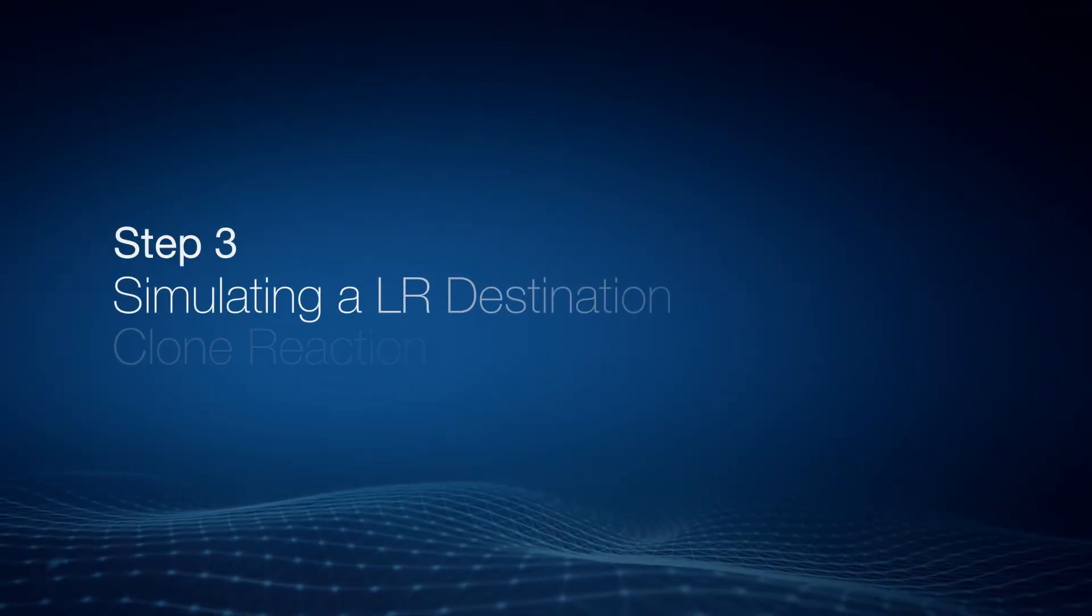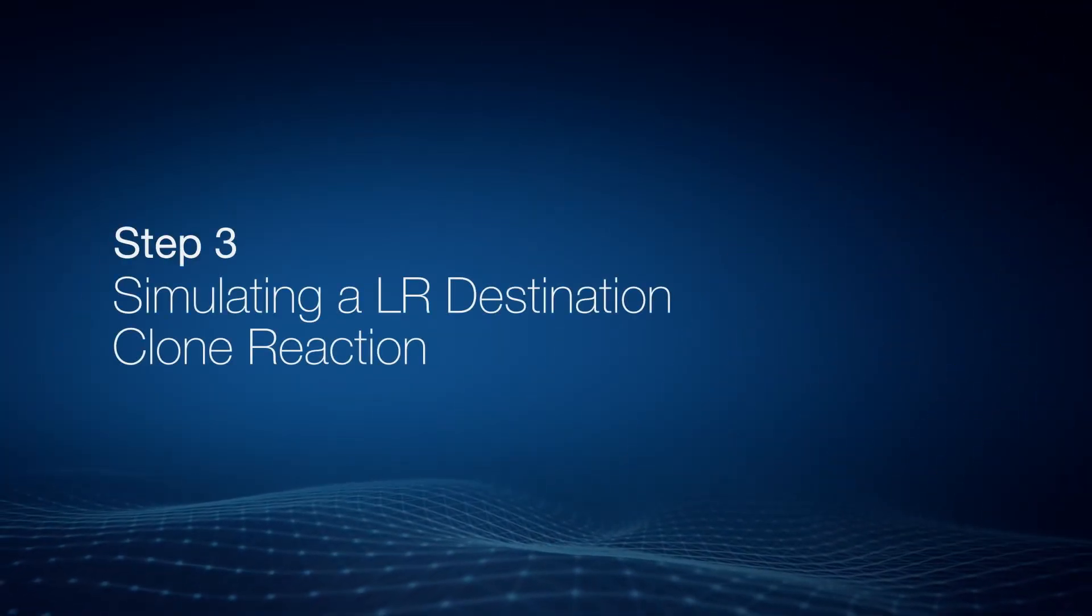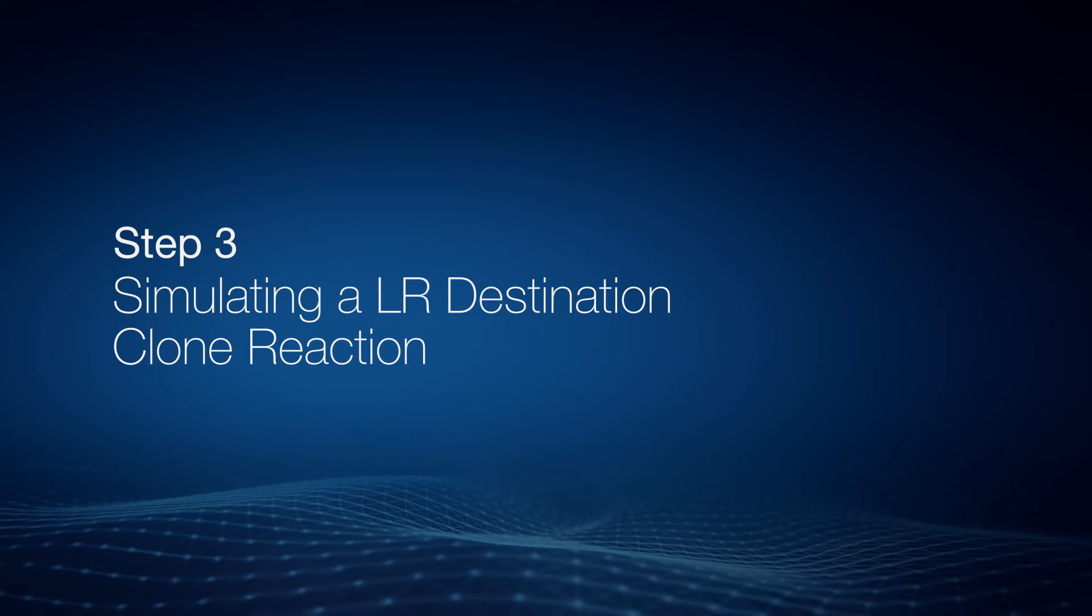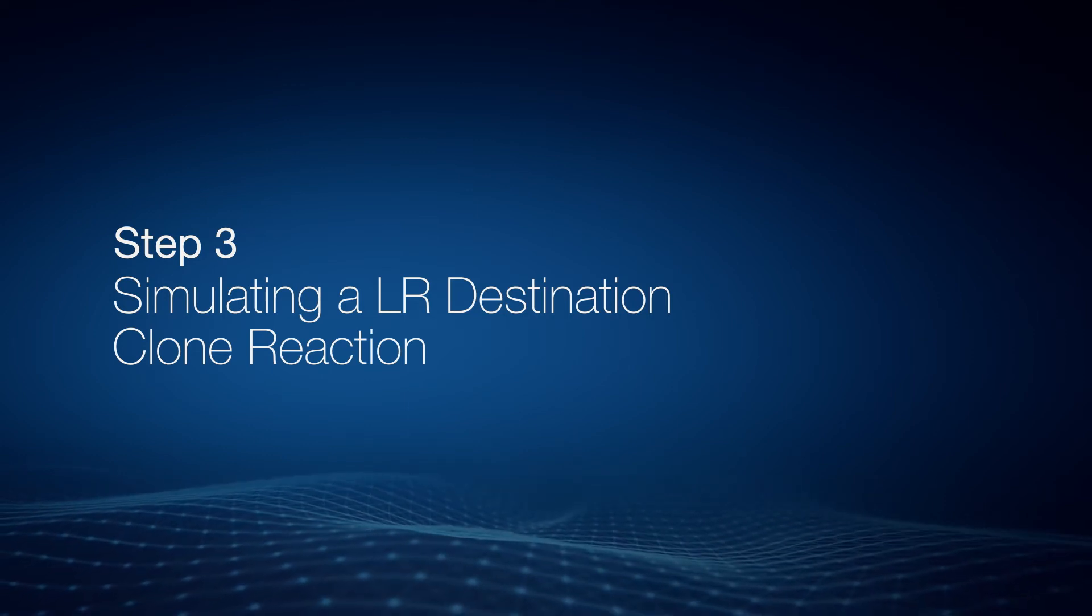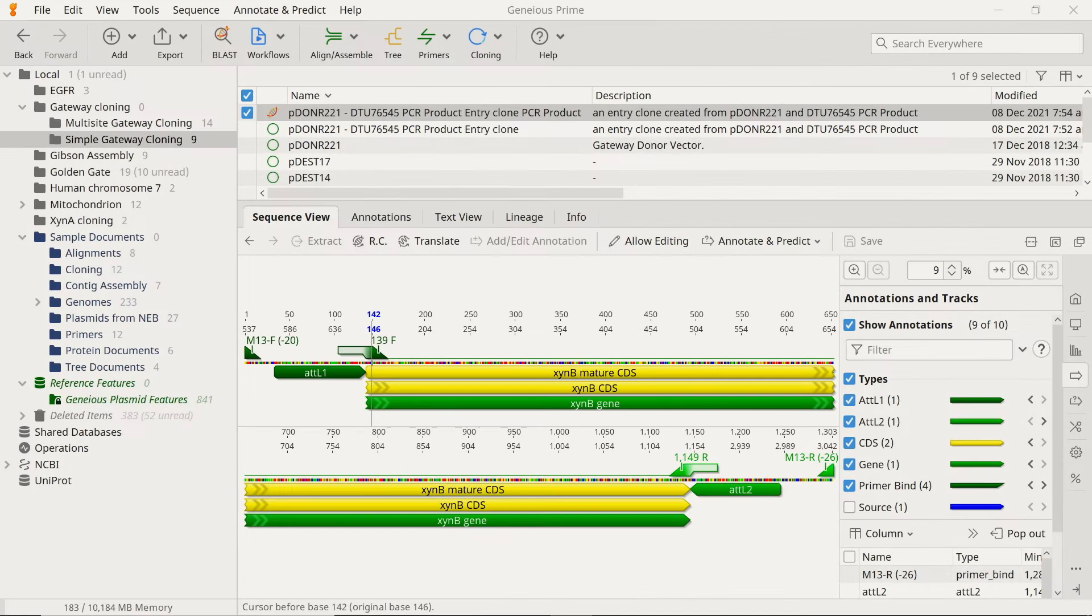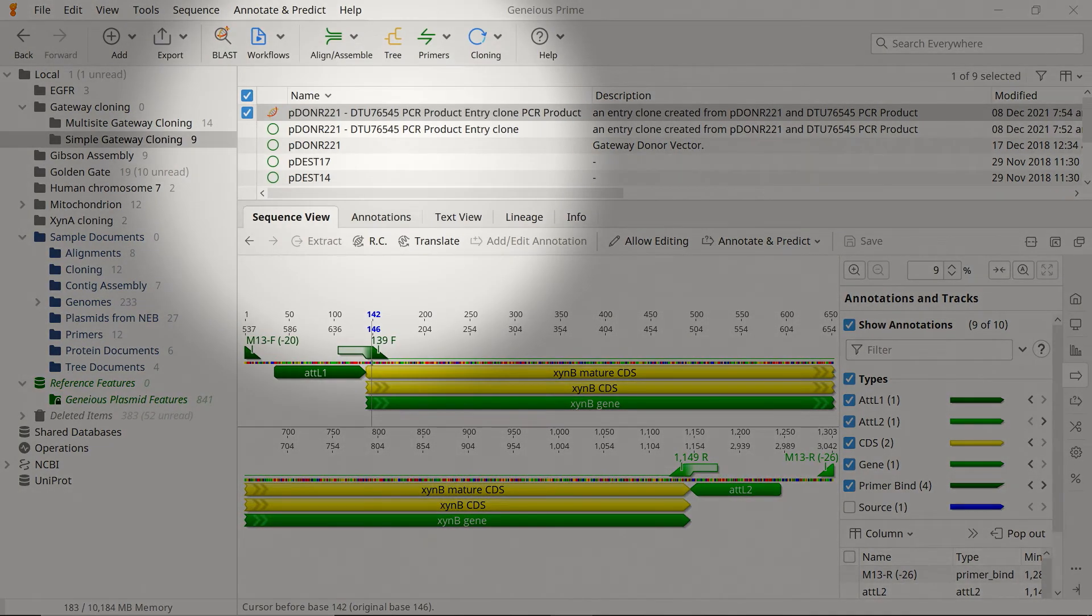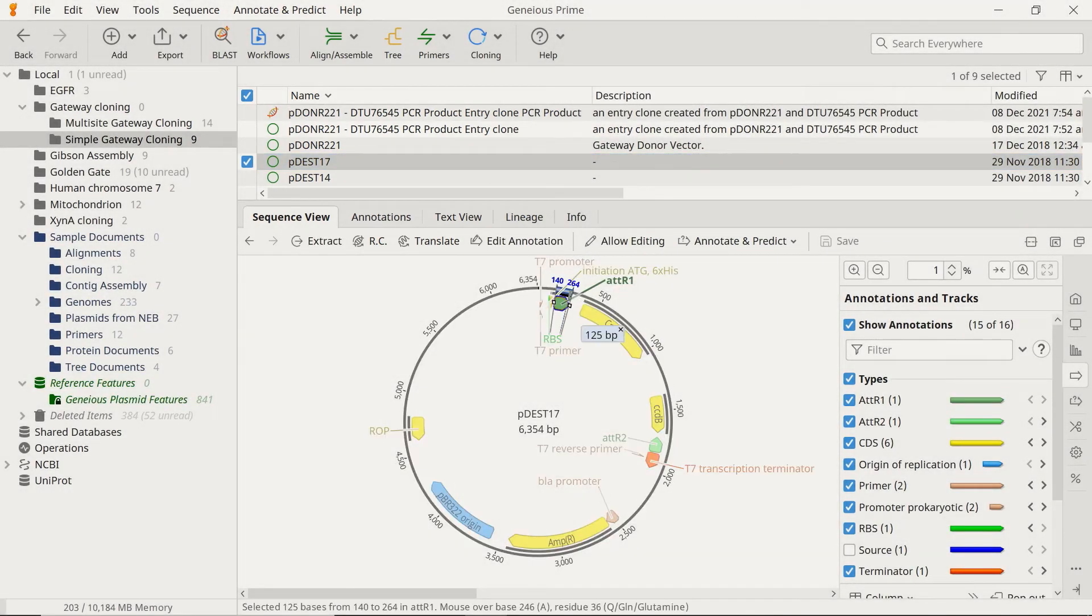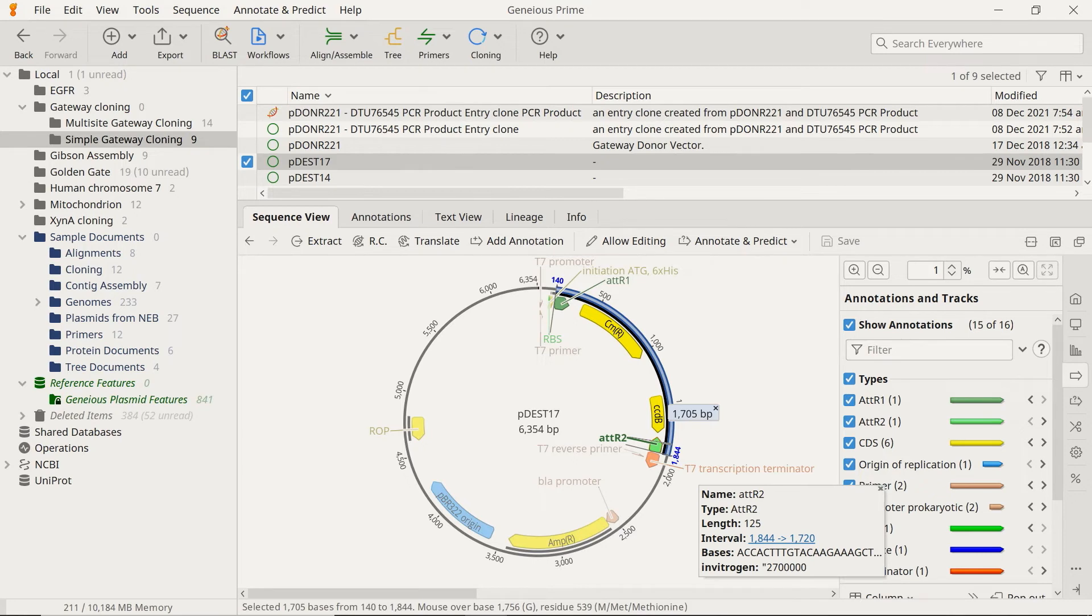For the last step, use the newly created entry plasmid and perform an LR reaction to produce the final expression clone. To do this, you will need a destination vector, such as pDEST17, which contains the attR1 and attR2 sites. These attR sites will recombine with the attL sites on the entry clone.